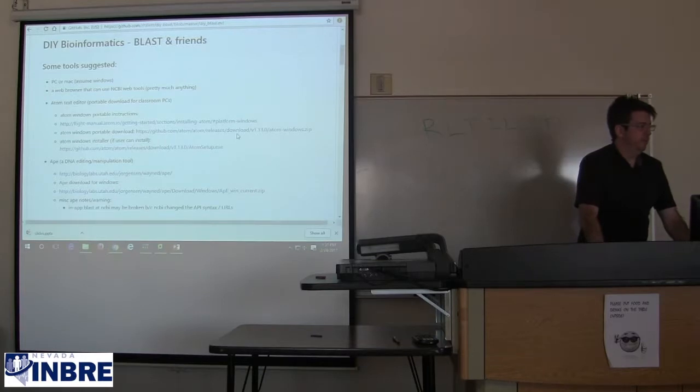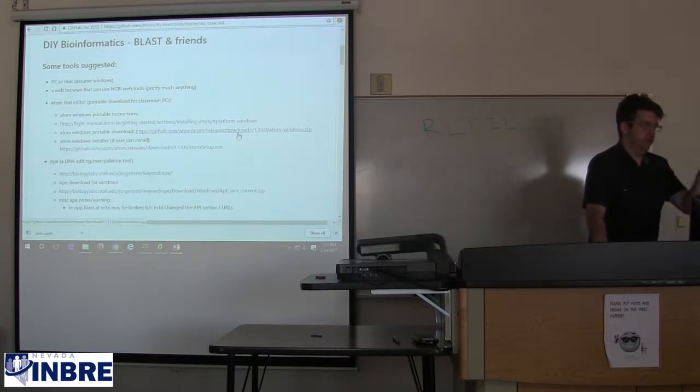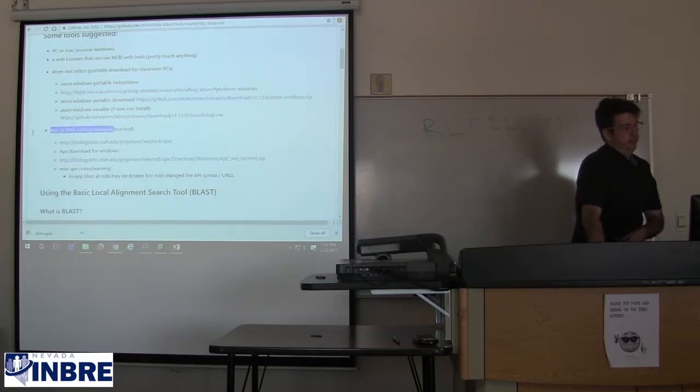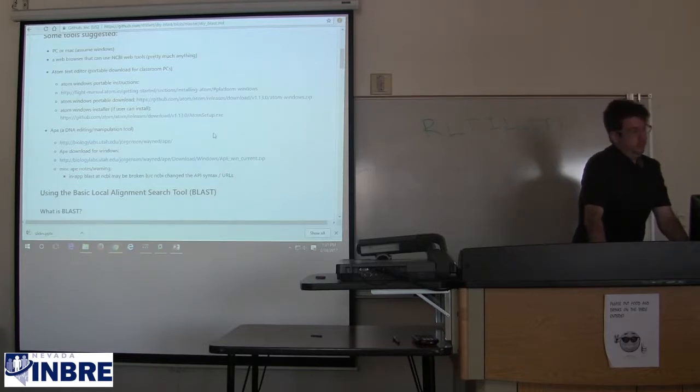But I've included some prerequisite tools that we're going to download and quote-unquote install. But since you may not have installation privileges on these machines, these should be pretty light installs, and if we can download and get them to run, they will run. And these are some pretty basic tools, just a text editor and a slightly fancy text editor used for molecular biology purposes called APE. And let's see if we can get these downloaded and at least kicking and running.